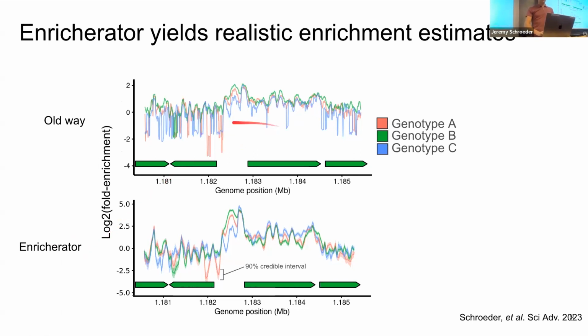Right away, up on the top, I think what you'll appreciate is we see a bunch of these dramatically, unrealistically negative discrete spikes in the inferred log scale enrichment. And we know these are unrealistic just based on thermodynamics, basically. There's not zero enrichment of the actual signal of interest.